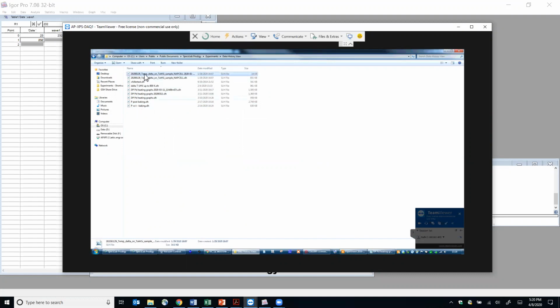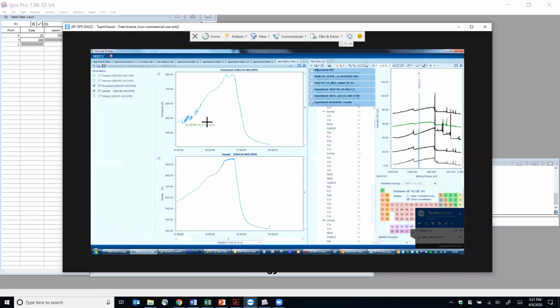Every one of these in one graph, not all of them in one graph, because they are different days of experiment. Sometimes pressure, but here, this one, yeah, I want these two in the same graph. Oh, so this one and then the one that you showed me before, they are different. So I basically want to combine this graph into the same, these two graphs, yeah. Okay.